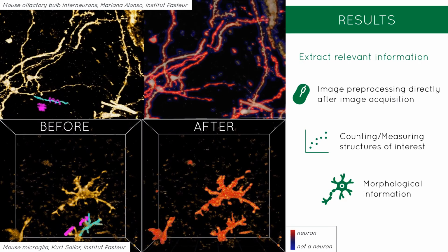Here you can see the two different applications of our voxel learning pipeline. On the top, it's the full image from which our working example was drawn. You can see that the segmentation can easily propagate to the full volume. On the bottom, it's a different example. It's a mouse microglia image here with a 2-photon microscope. You can see that even though it's not the same structure, the segmentation is perfectly conducted as well.